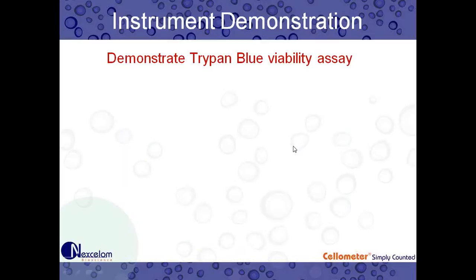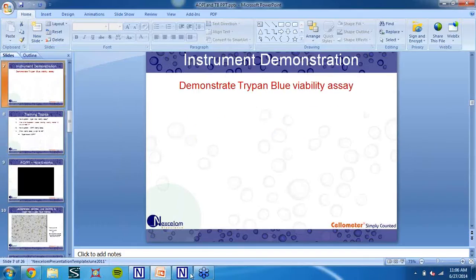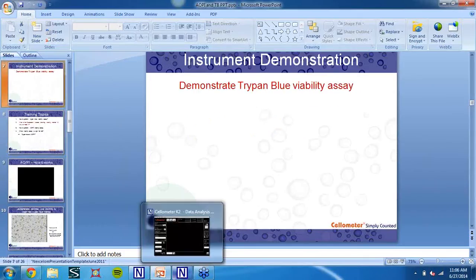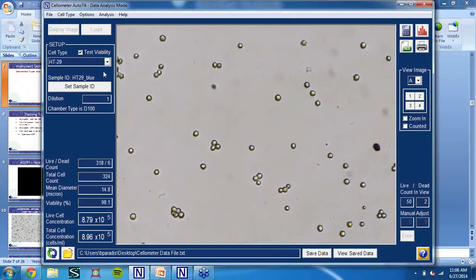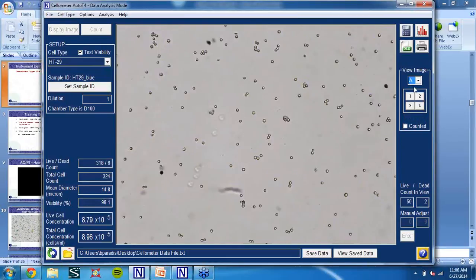Now I'm going to switch to my Auto T4 software and take a look at some cell images. These are actually our HT29D4 cells, stained with Trypan Blue. If we maximize the image, you can see some of them are clumpy. I can make out one, two, three, four definite dead cells around the image.